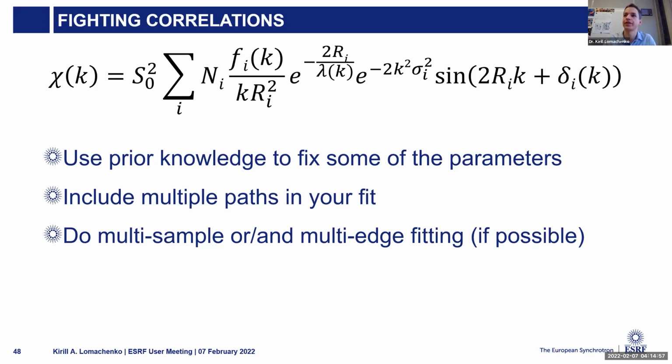And this may fix some of the correlations. Usually, the higher your number of parameters, the bigger the problem with correlations you have. So these are the strategies that can help to reduce the correlations.